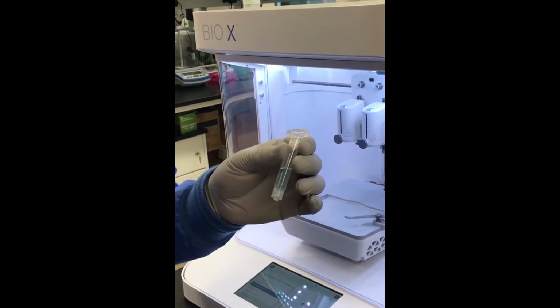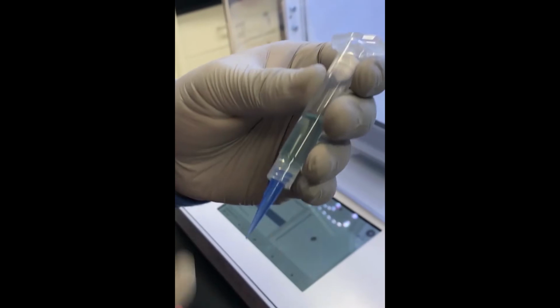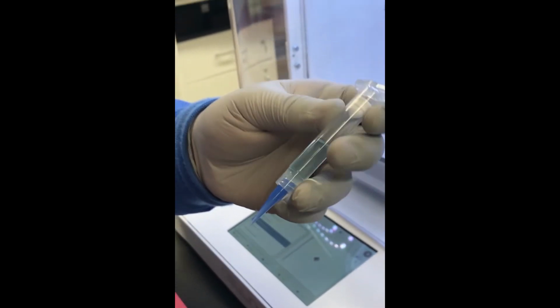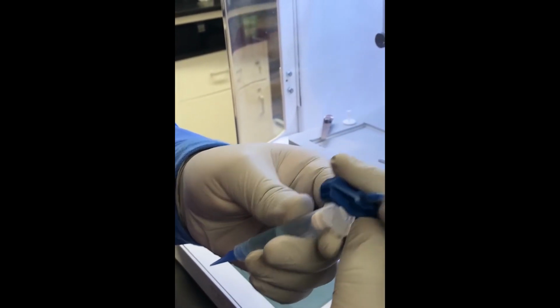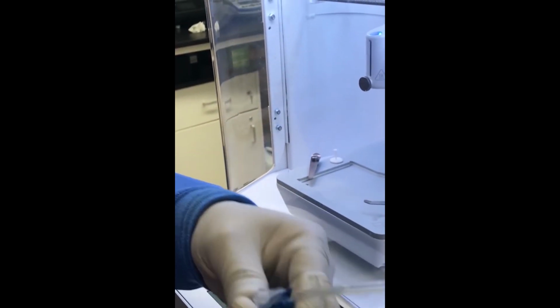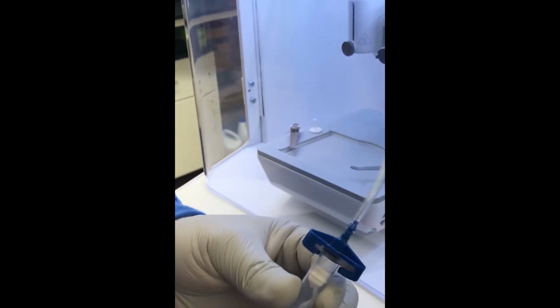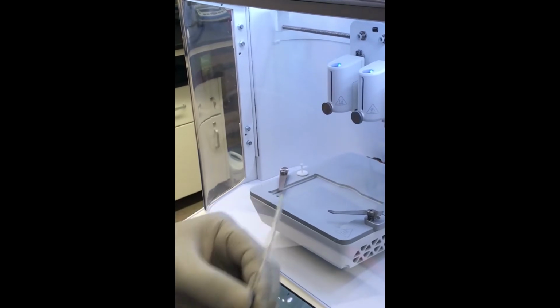But this was already loaded, so here you just attach the nozzle at the end. Here it's a 22 gauge nozzle, and this is the tube that is used to push the air through them and control the pressure to push out the bio ink.